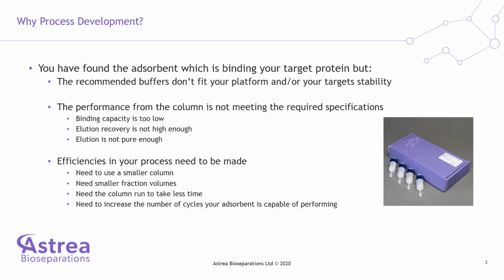It may also be that you need your column run to take less time, maybe to fit within a shift pattern, or to make it financially viable, you need to increase the number of cycles your adsorbent is capable of performing.